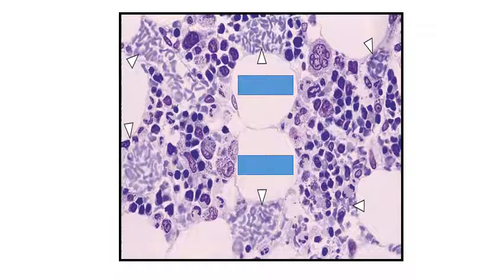So here we have an excellent example of our bone marrow again, and here we have an adipocyte. How do we know it's an adipocyte? Well, now we can see red blood cells that are fully formed, and this is going to be our sinusoid now. So these are adipocyte. All right, sinusoid. Look at the red blood cells. Take in the whole picture. Be like a pathologist. You take a step back. What is this tissue? What does it look like? What am I looking at? So we have our red blood cells, and just draw the line. The red blood cells aren't leaking out, are they?